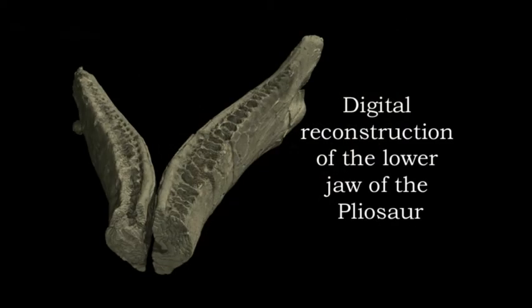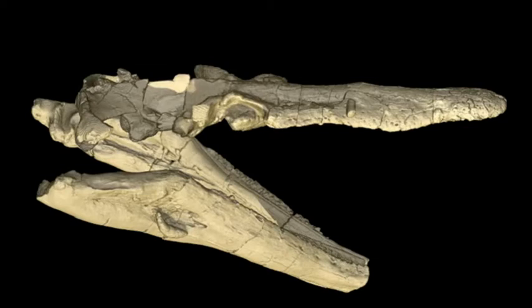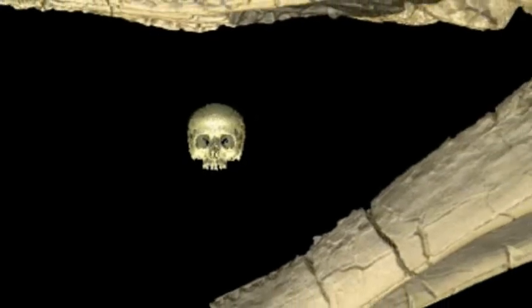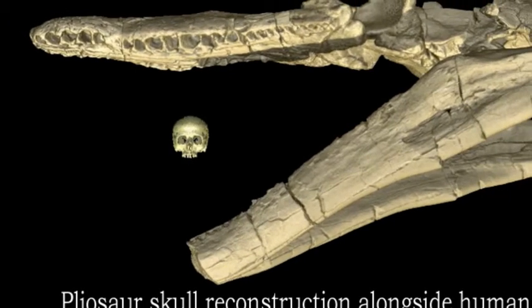The pieces are large lumps of rock, and it is of considerable interest to take the small bits that the skull has become broken down into, scan them, get the exact structure, and then digitally reconstruct it and see what it was like when it was intact. We can also see the internal structure in considerable fidelity. We can pick out where blood vessels, nerve channels would have laid, where tendons would have been that were holding the whole thing together, where teeth sockets went right down into. There's only a handful that has been found in the world, and the skull we have represents one of the most intact and least deformed, and therefore is a very valuable resource to gain information from.